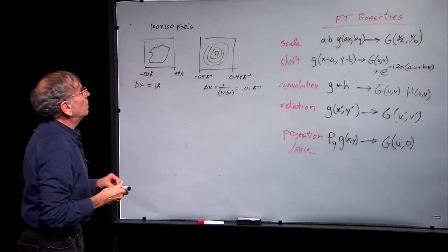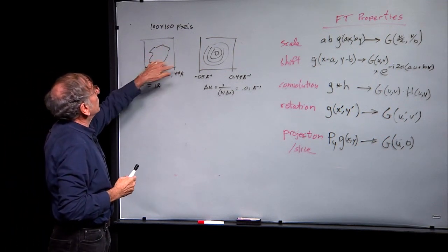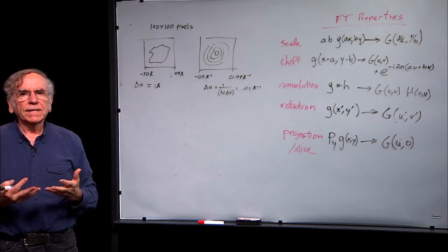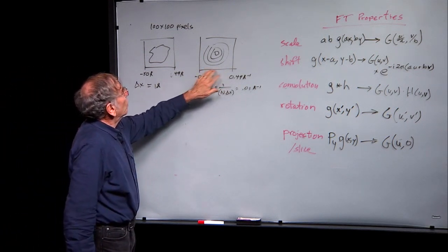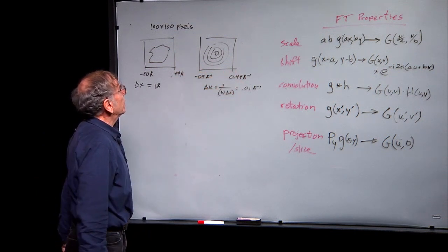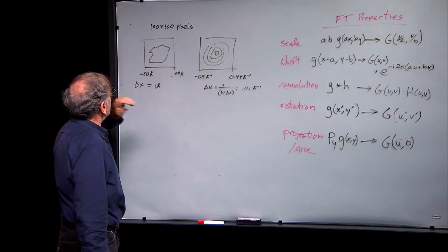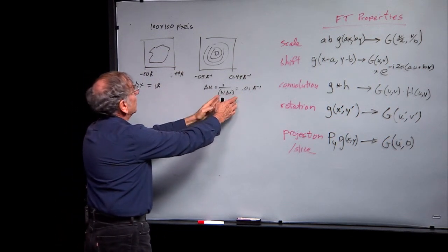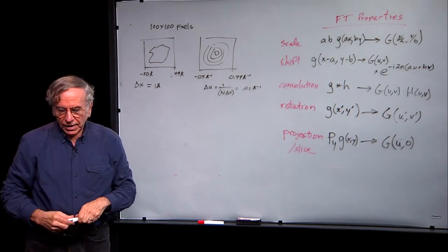So this is how we can calibrate the Fourier transform of something that we know in terms of spatial frequencies, in this case in terms of inverse angstroms. We always go from minus to plus the Nyquist frequency, which is half of an inverse angstrom, and the steps are the same as 1 over the entire size of the original image.